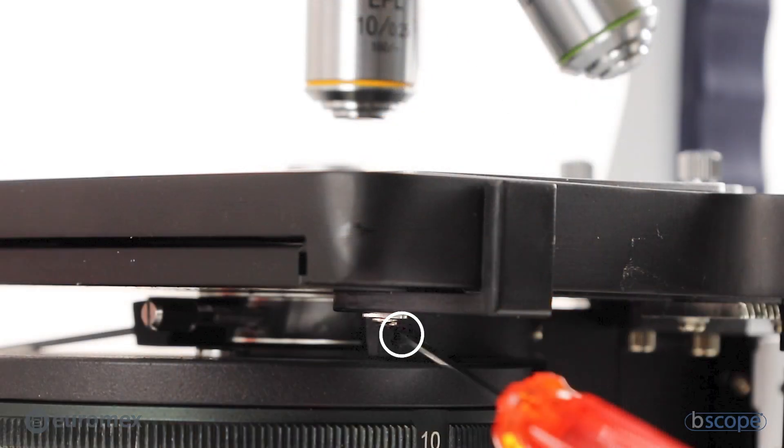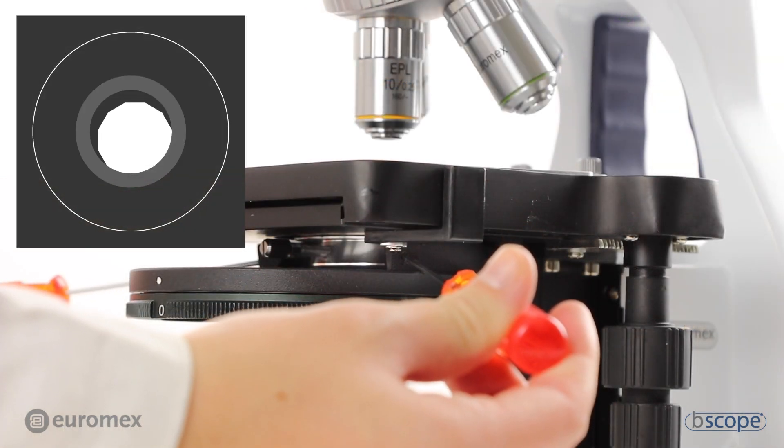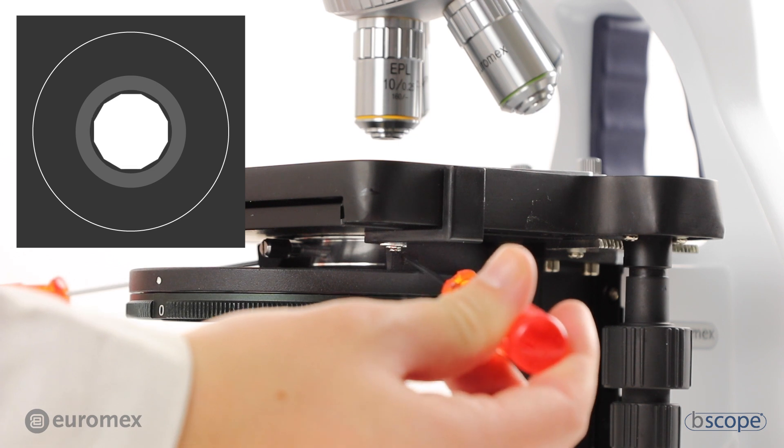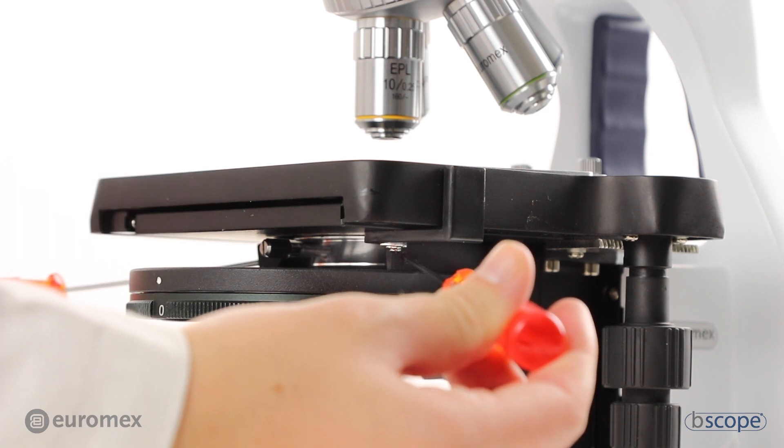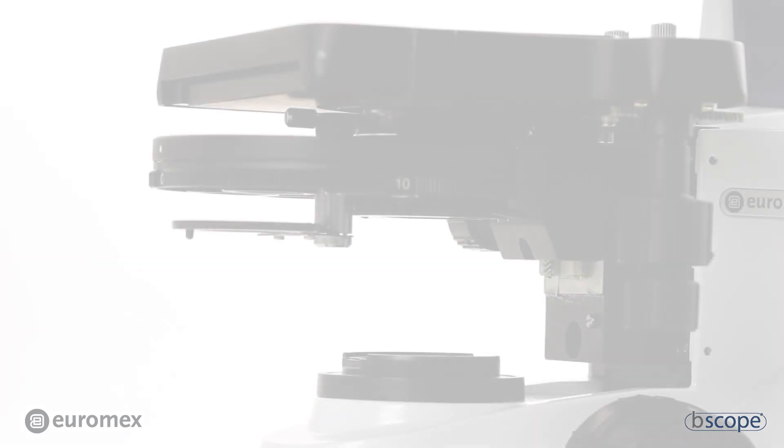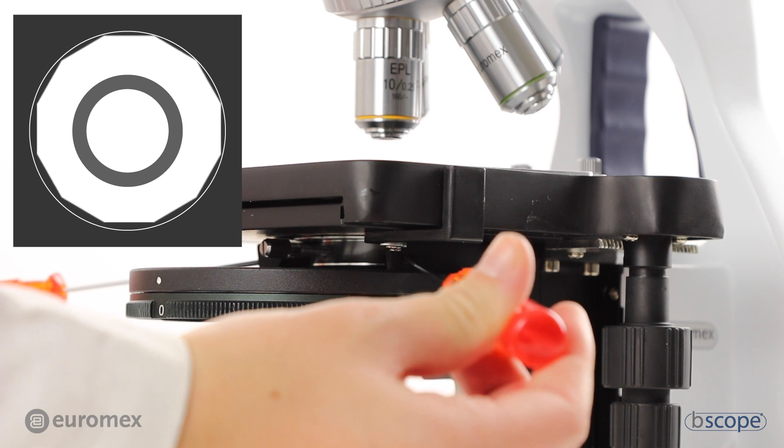Adjust the condenser using two allen wrenches. To check if the condenser iris is properly centered, open the iris to the edge of the view and fine-tune the centering using the allen wrenches.